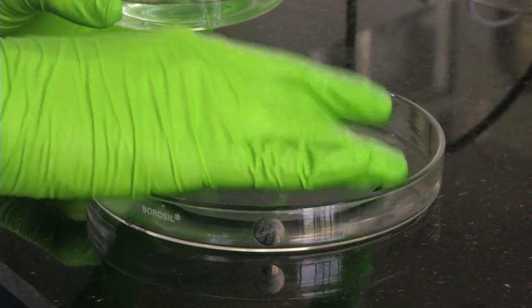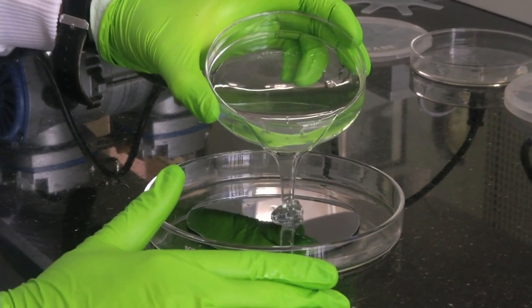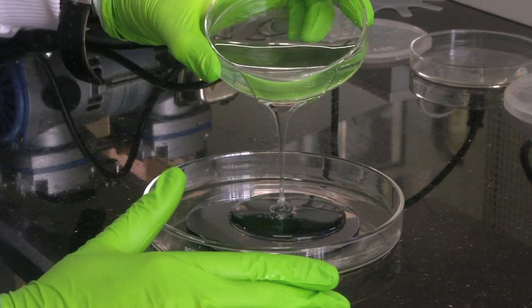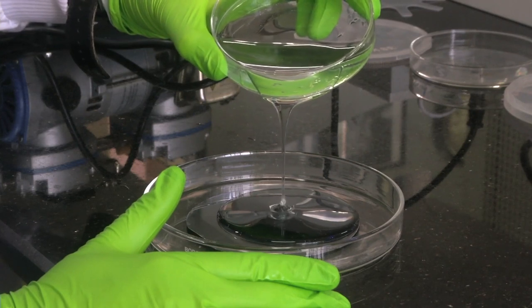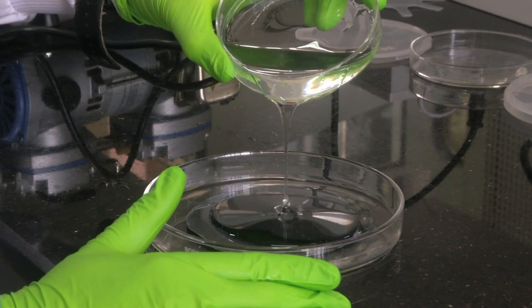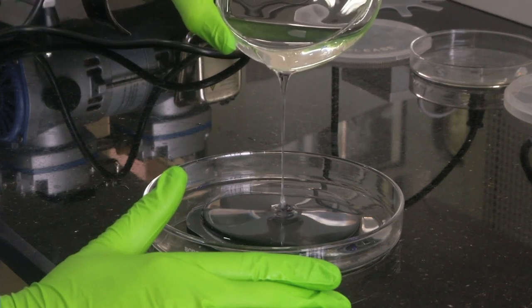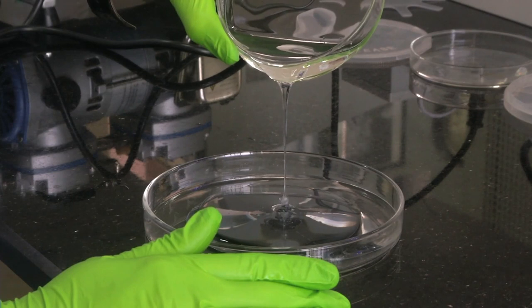We have the mould here - we have put it in the petri dish. Now we have to pour our PDMS curing agent mix on top of the mould. As and when we pour, more air bubbles are getting formed. So we have to do one more level of desiccation to remove the air bubbles formed in this second round of pouring the PDMS onto the mould.